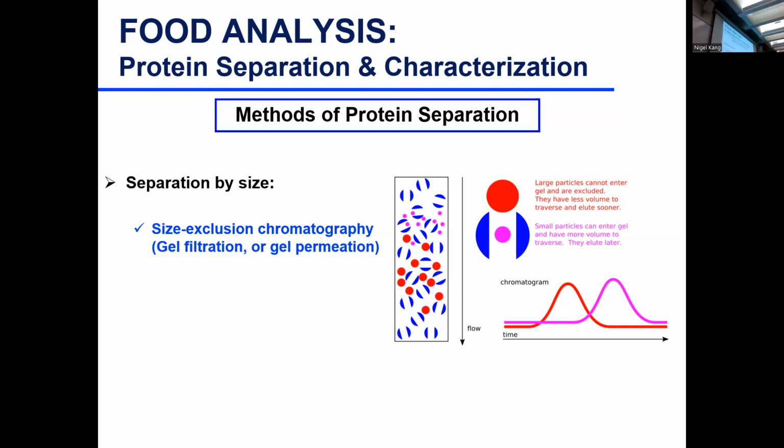And then here, and then this, and then this, and then this. So the biggest protein, the largest size protein molecules stay here. And then smaller one, and then here. If we have smaller than this, there is no separation for them. They all go with this one.